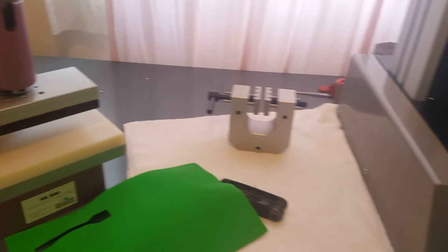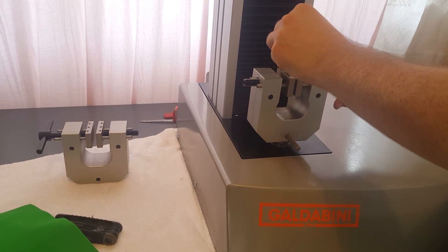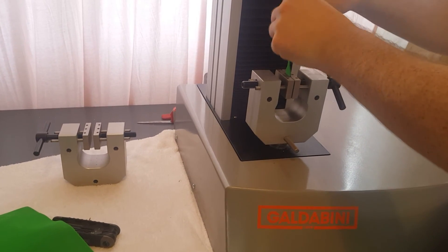We'll go ahead and mount it onto the machine here with our vise grips, just like that.